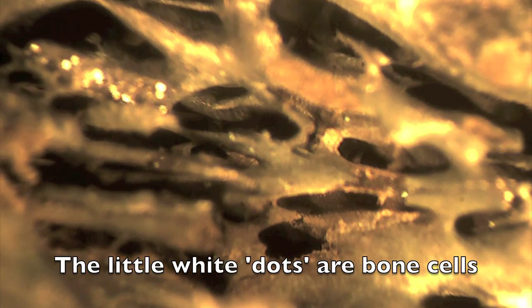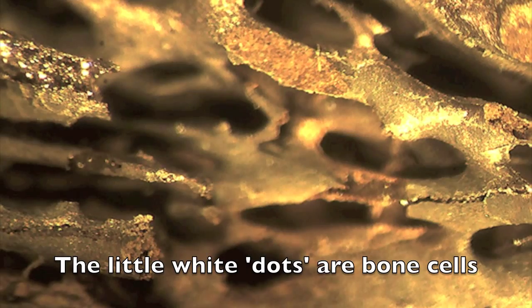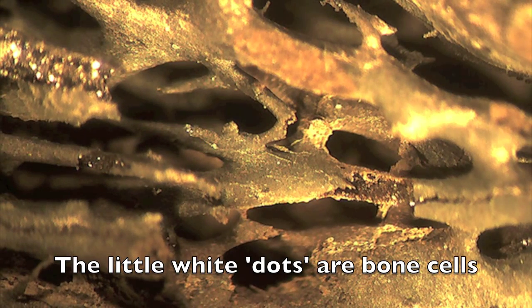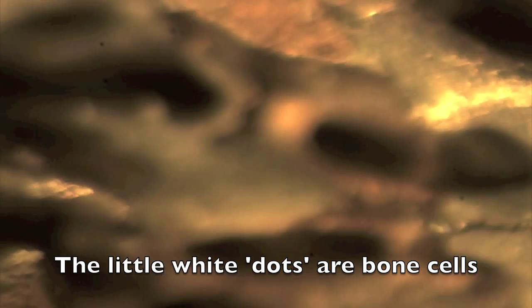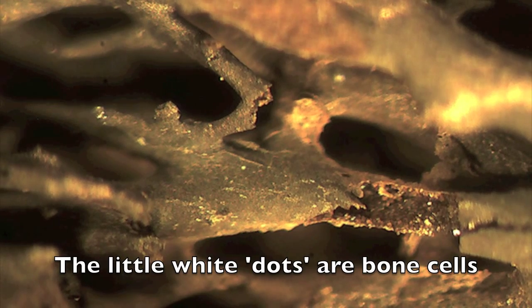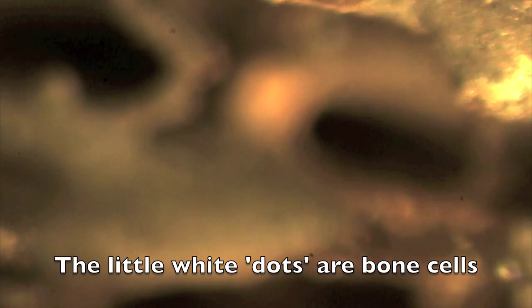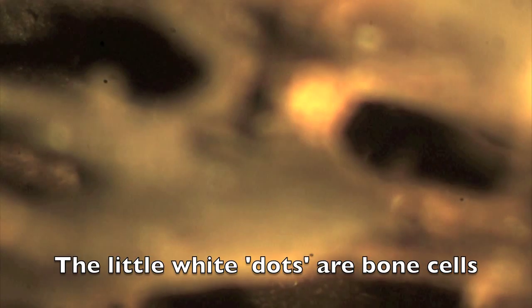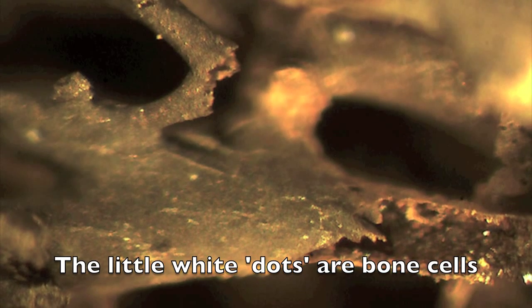As we zoom in, take note of the little white dots. The white dots are actually the bone cells lying on the outside of the vessels. There are soft tissues coating the outside of the blood vessels, and you can see these tiny white dots — those are the bone cells that we're going to image under the compound microscope. You're going to have to soak your bone for quite some time to expose these soft tissues.